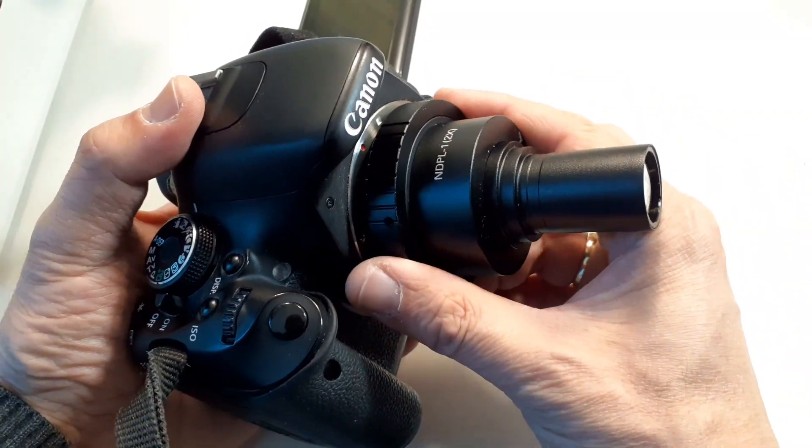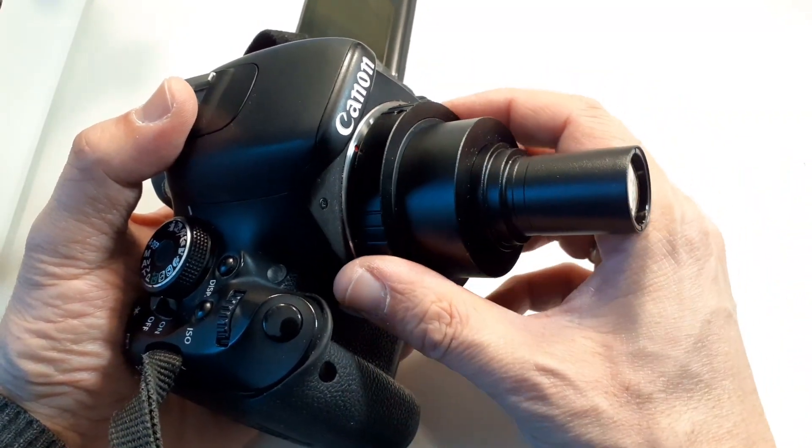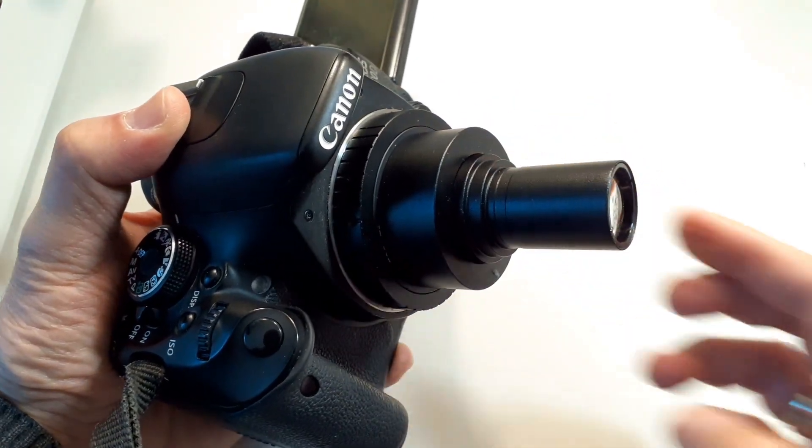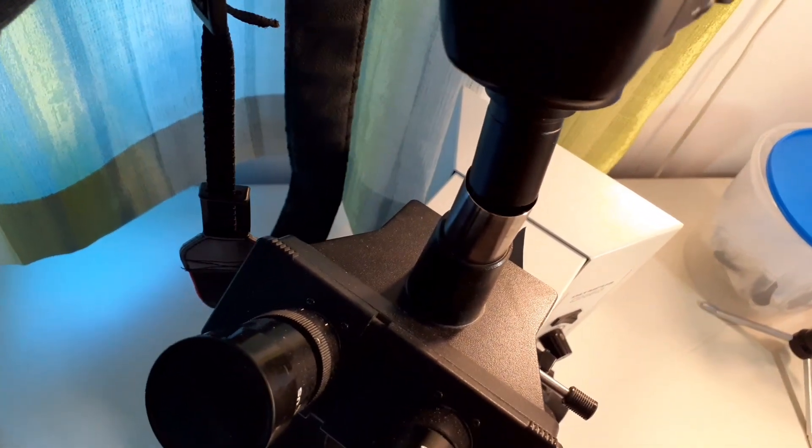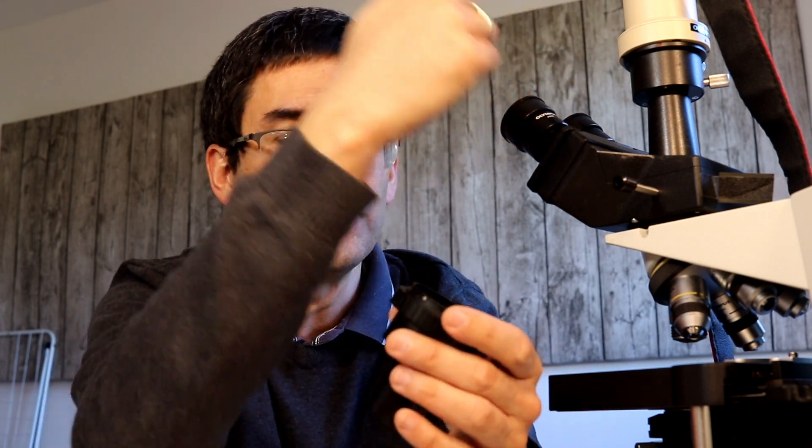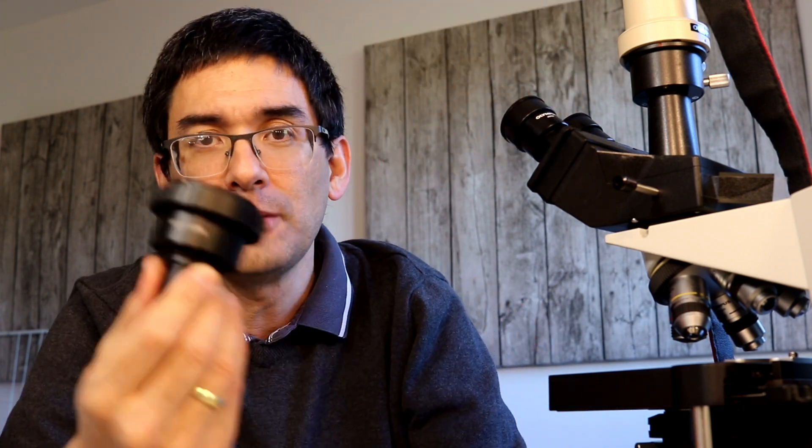But what I found out is that while this gives a pretty good result, it's only pretty good, it's not excellent. So with some objectives, the optics don't quite cooperate quite well, and there's some blurriness and fuzziness on the corners with a 4x objective. Also could be a problem with that if it's not a plan objective. But I'm getting a better result with the optics and adapter and everything being from the same company than just using a generic one. But considering the price difference, I mean these are relatively cheap compared to the whole thing that I have here, so it actually might be a workable solution as well.